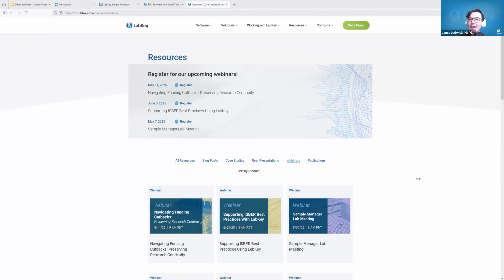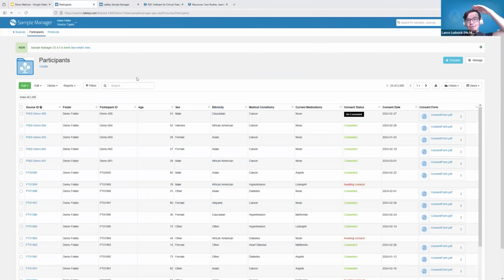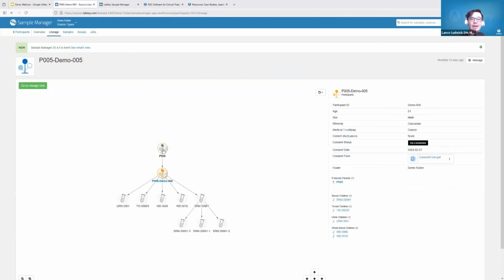It's all the data in a linear fashion. So I think we do have data going from top to bottom, if that's what you're meaning. We can show how this looks, where basically the top of our data is stored here. Then we have these different levels and different tabs for different information organized differently than top to bottom. I would like to speak with you, Jan, on that and what you're envisioning. We can have different sets of data that go like this. Typically, it's going to be streamlined like that, but we could probably work with you in understanding what your specific needs are so we can make sure that we're capturing data that you need.